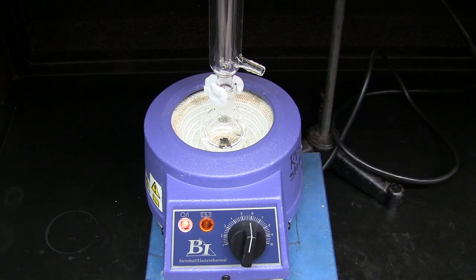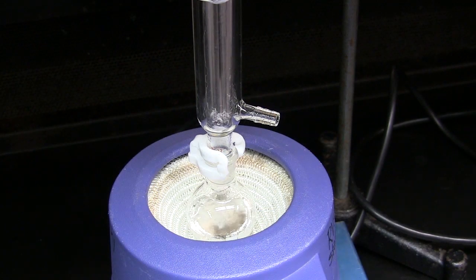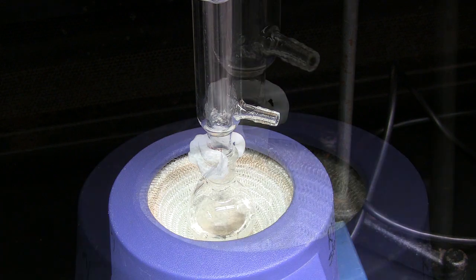Heat the reaction mixture to reflux. The alkene product will begin to form soon after boiling begins and will distill over as an azeotrope with water.